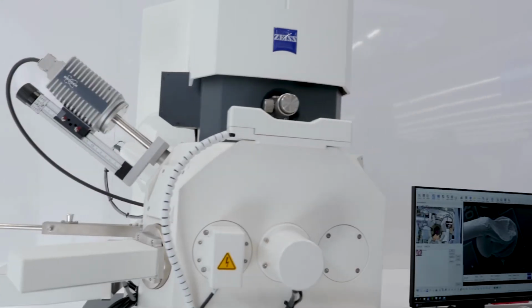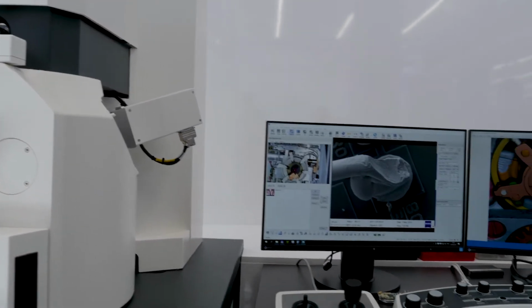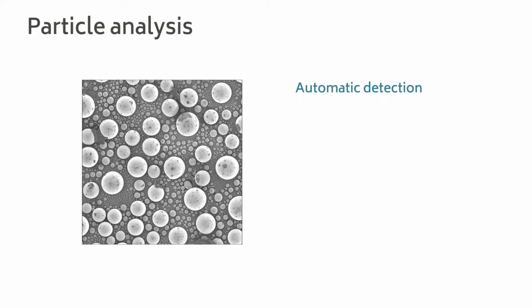We have a wide range of portfolio when it comes to digitalizing surfaces and measuring roughness and topography. This is a growing field that we see as an application is really growing. And the software which we use and all those technologies for visualizing and analyzing the data that we are capturing is MountainsSEM. Since for us this is the industry standard and what is asked most by our customers.